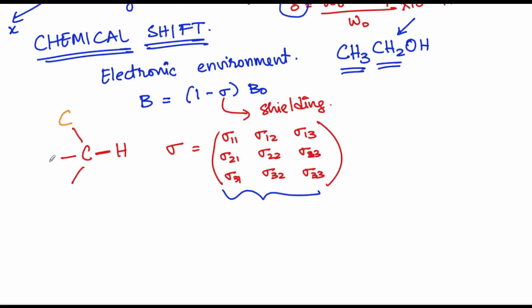For instance, let's say you have other carbon atoms attached to this given carbon. With the electronegativity difference being 0, you can imagine, let's say, a sphere of electron cloud around this given proton. However, let's say we take some other example where this carbon is attached to a fluorine atom. In such a case, the previously equally distributed electron cloud gets pulled towards the fluorine, and you might end up having something that is anisotropic. Instead of being a sphere, it could be, for instance, an American football.